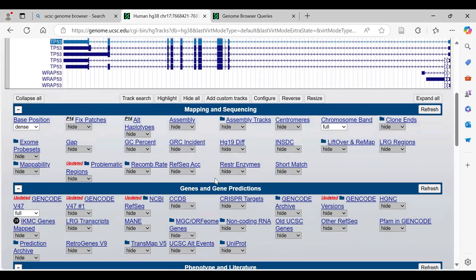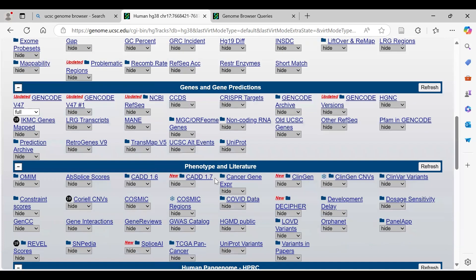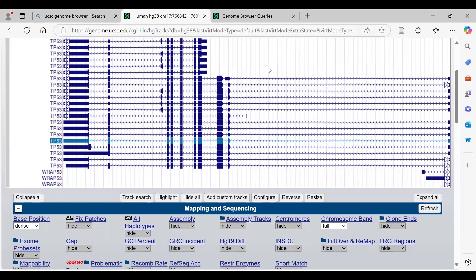So this was all the information that you can retrieve from UCSC Genome Browser. That was all for today.